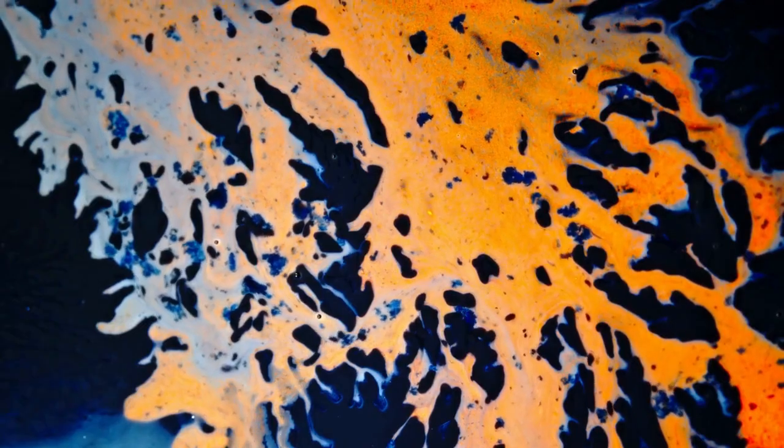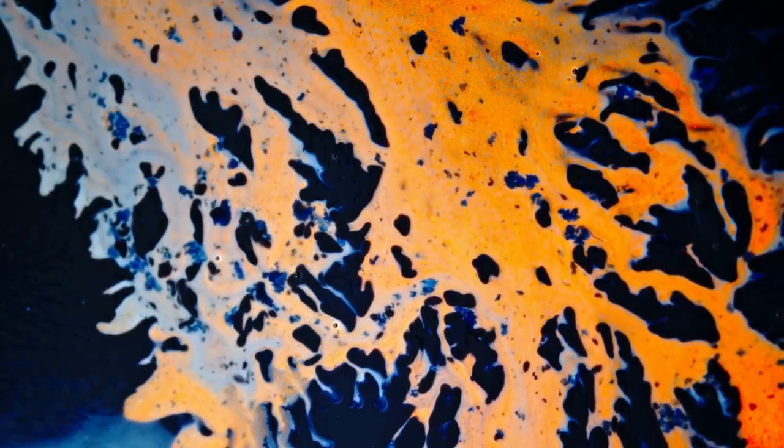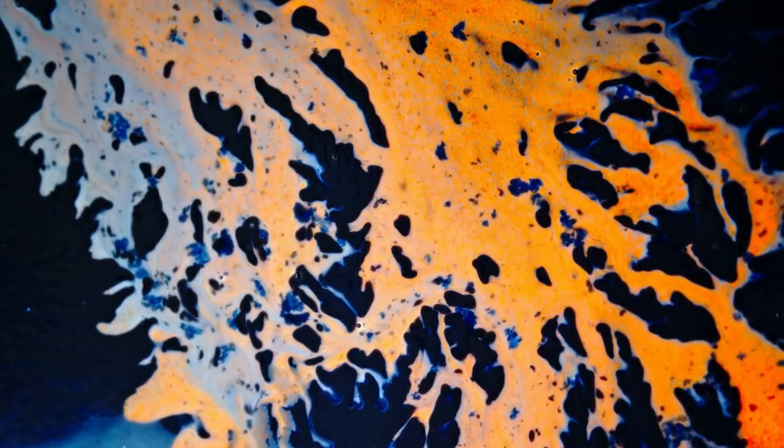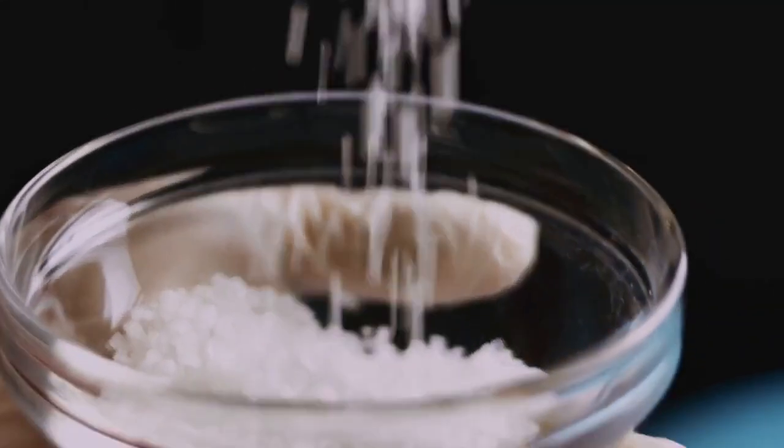If you use a very nonpolar solvent, like hexane, it won't be able to pull polar compounds off the plate, so they won't move far from the starting line. If you use a very polar solvent, like methanol, it will be so good at pulling compounds off the plate that everything, both polar and nonpolar, will race to the top together, resulting in no separation.